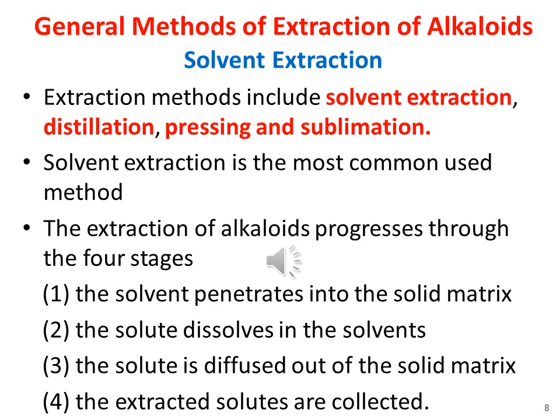Any factor enhancing the diffusion and the solubility in the four stages will facilitate the extraction. The properties of the extracting solvent, the particle size of the raw material, the solvent to solid contact surface area, the extraction temperature, and the extraction duration will affect the extraction efficiency.